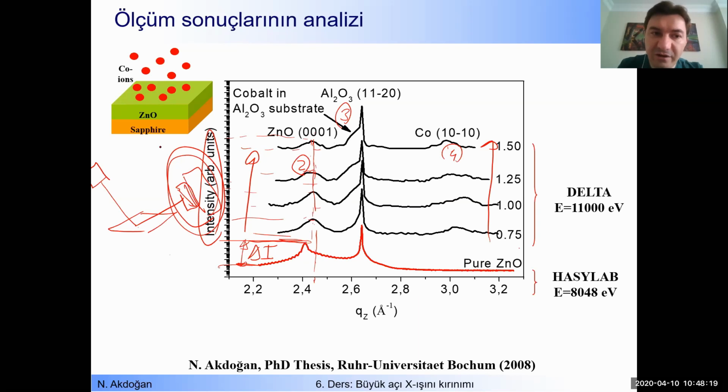Since we destroyed it, it cannot behave like a perfect mirror, okay? You can consider that you have a destroyed mirror in your bathroom, okay? So it will provide you much less intensity compared to the perfect mirror with perfect alignment of the atoms, okay? You can consider it like this.